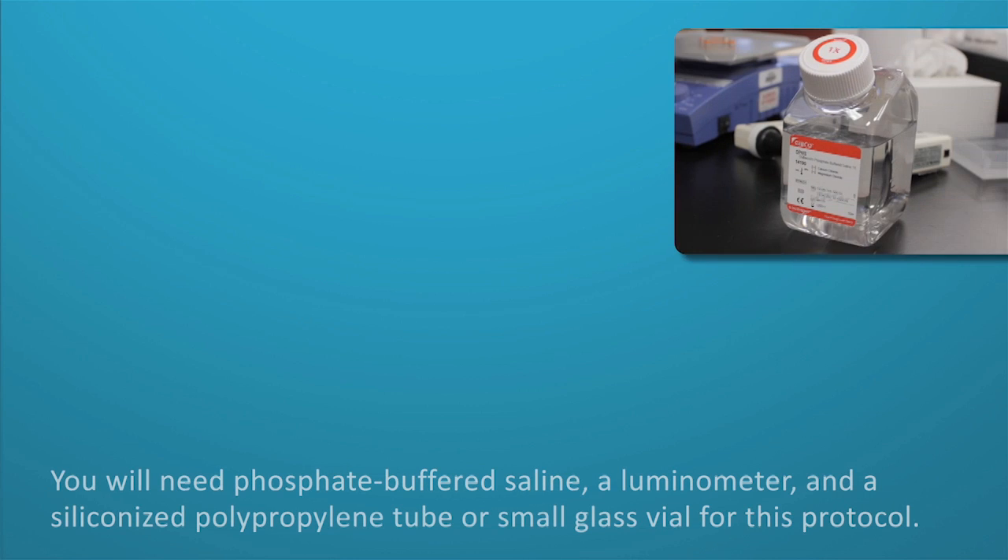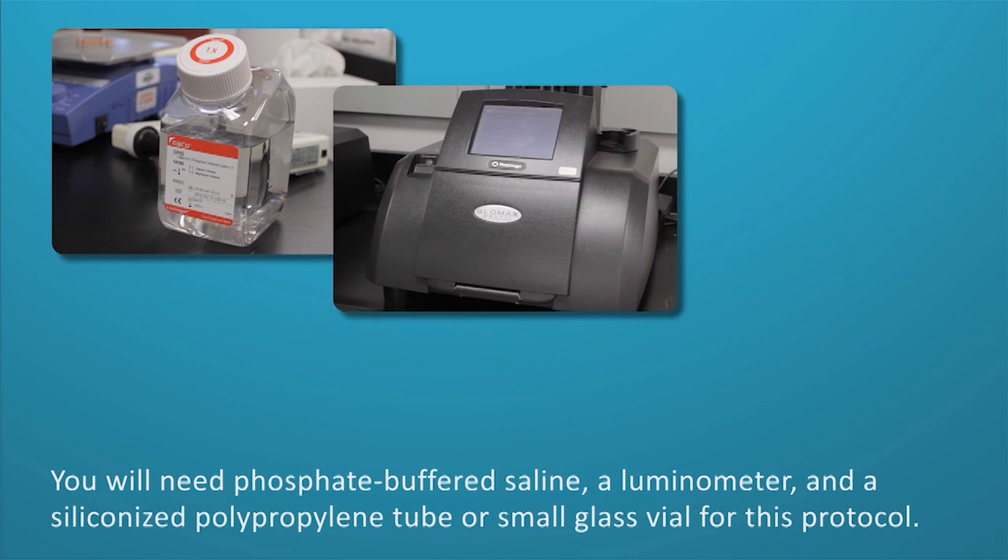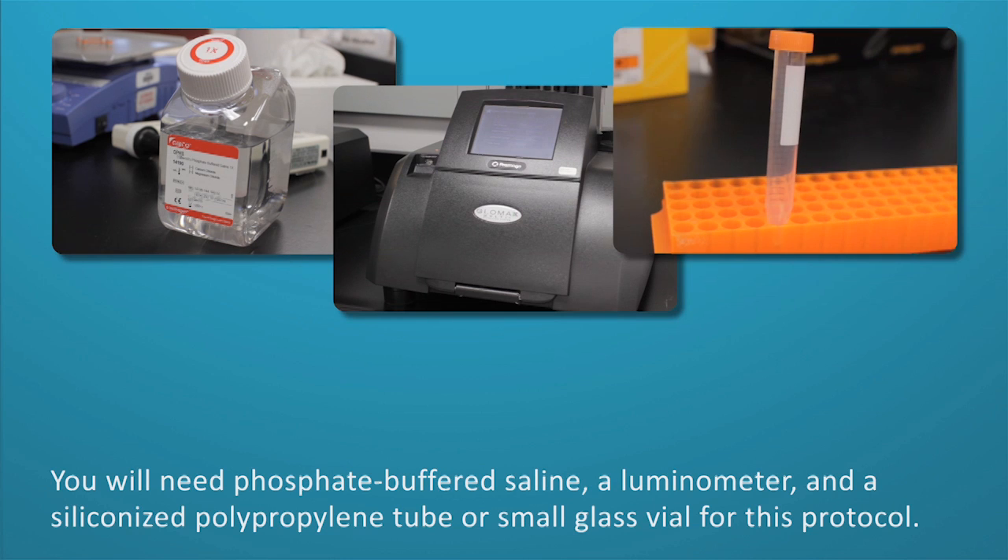Before you begin, make sure you have phosphate buffered saline, a luminometer, and a siliconized polypropylene tube or small glass vial.